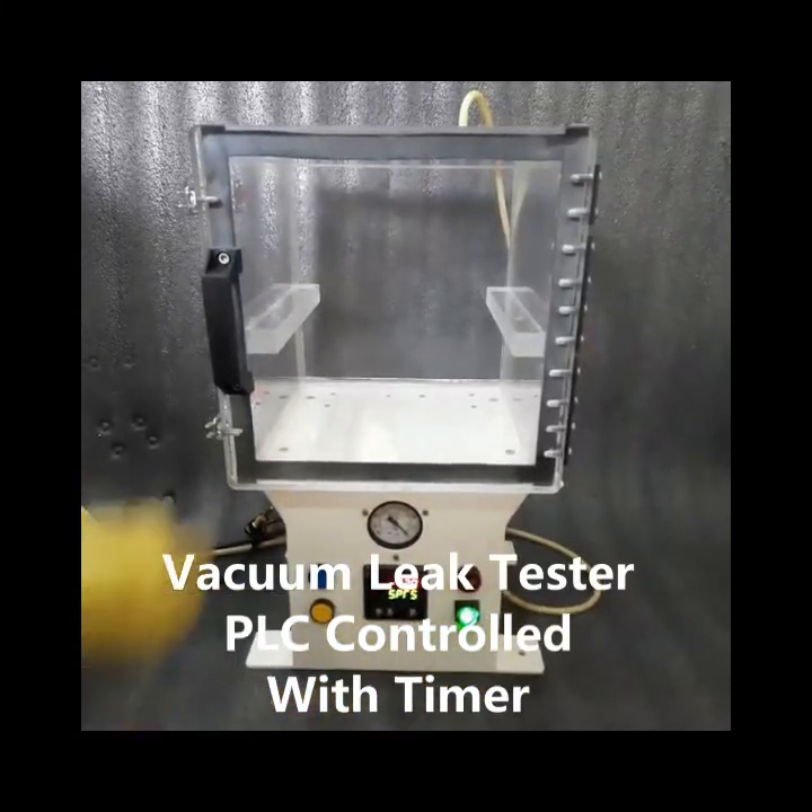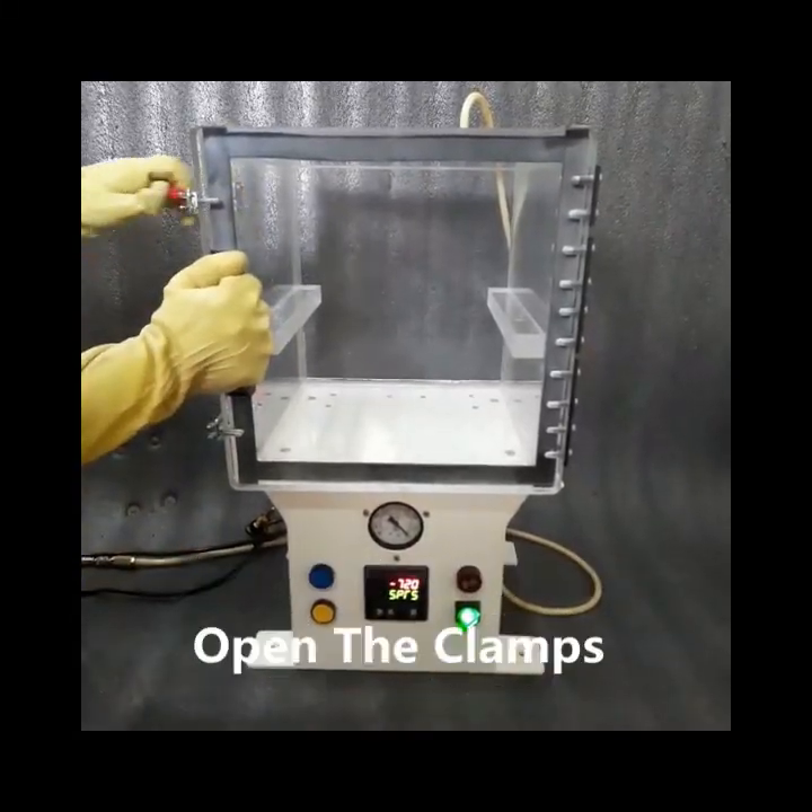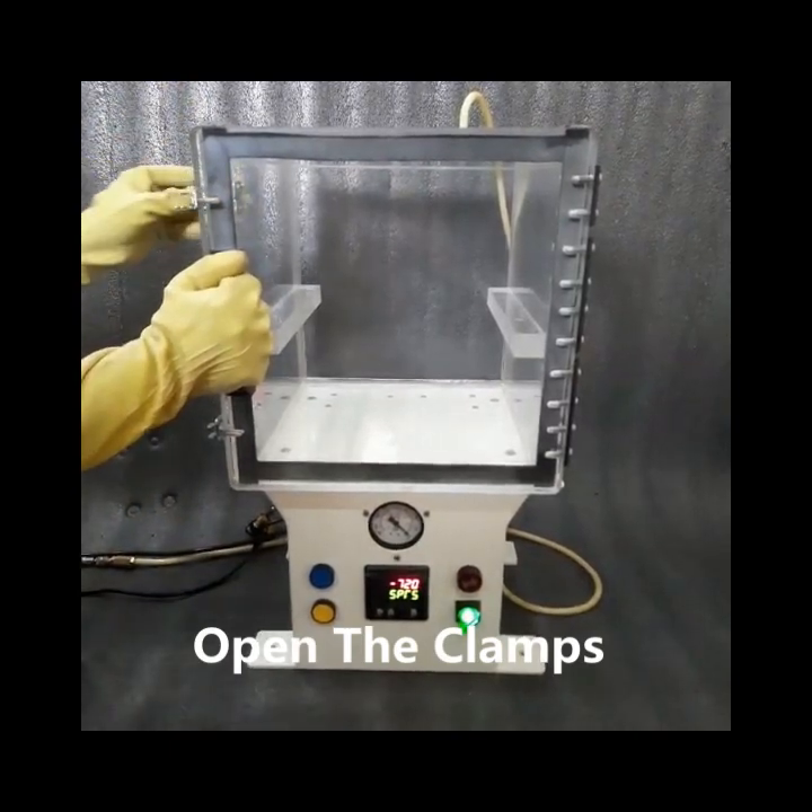Welcome to Burhani Engineering Technology Vacuum Leak Tester PLC Control Wheel Timer.